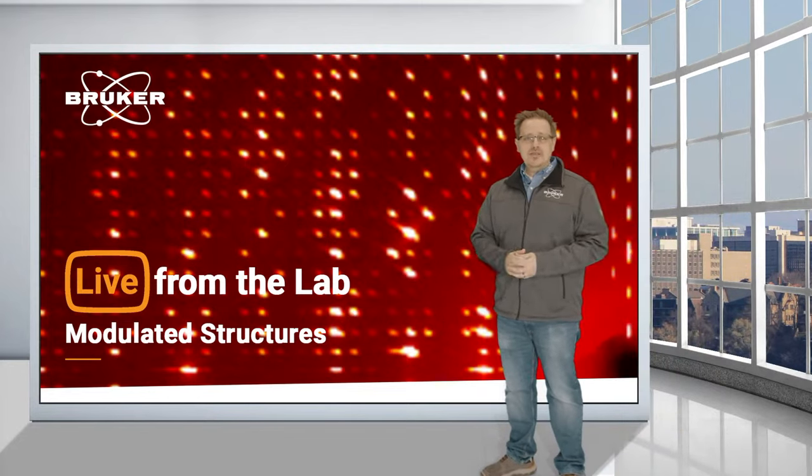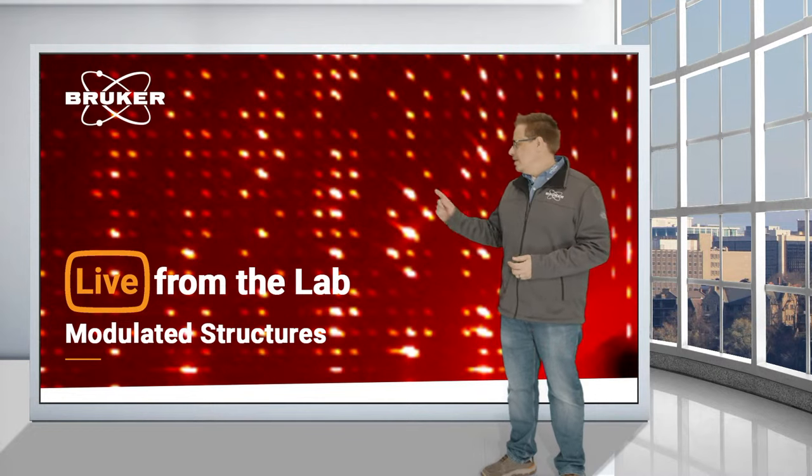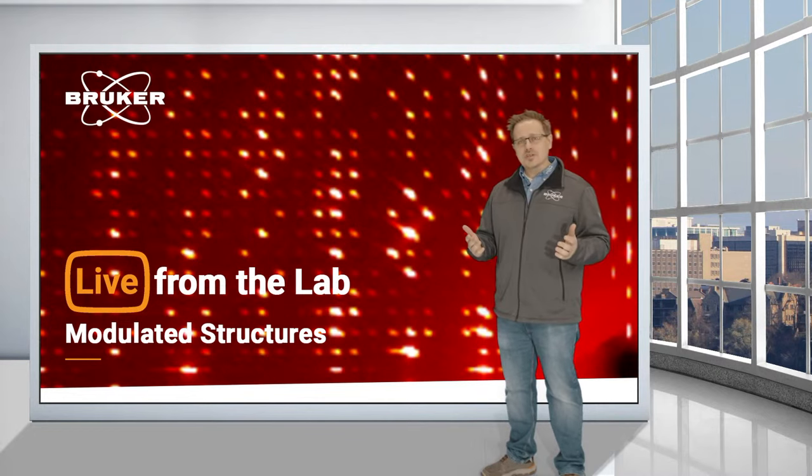This is the show where we talk about different technologies that Bruker has developed to help scientists discover the world around us. Today's topic is measuring modulated structures using single crystal X-ray diffraction. Now, what is a modulated structure? We're going to talk about that a little bit more in just a minute.